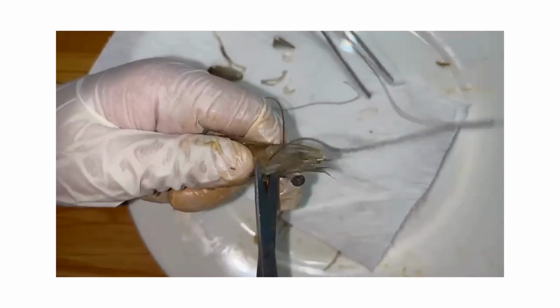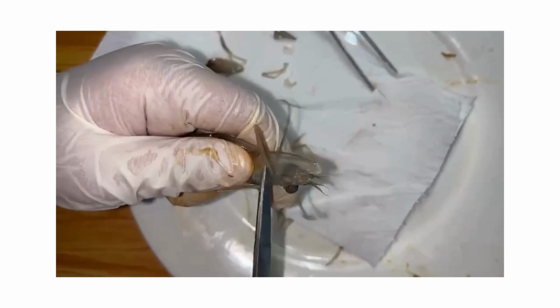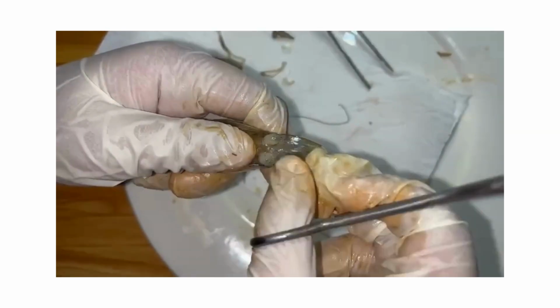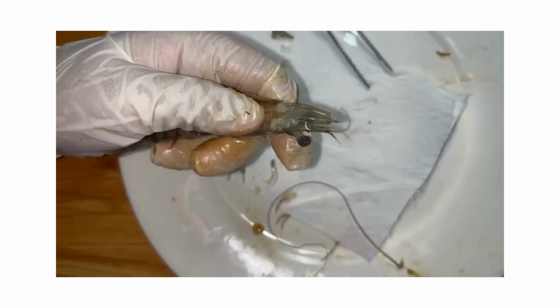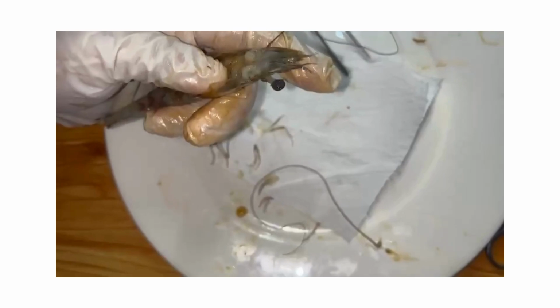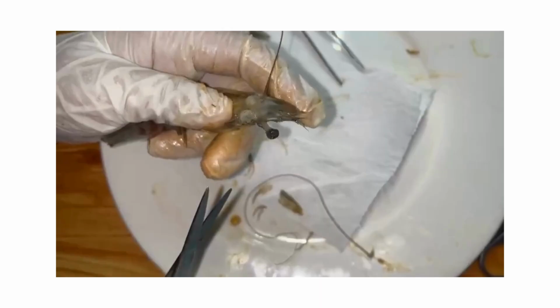Next is the removal of the antenna. To remove the antenna, use fine dissection scissors or forceps to cut each antenna at its base. Once removed, the dissection area becomes less obstructed, allowing for clear examination of the shrimp's sensory organs and feeding appendages. This procedure also highlights the role of the antenna in the shrimp's environment sensing abilities.